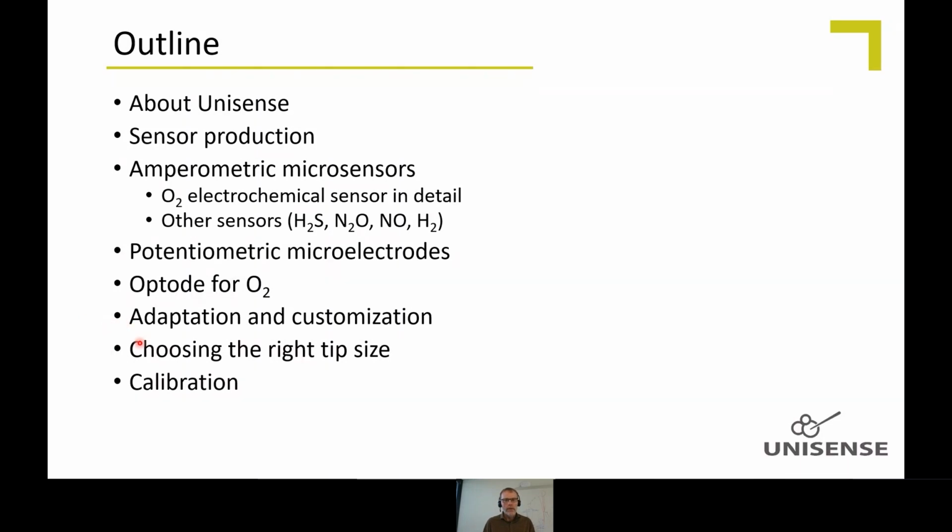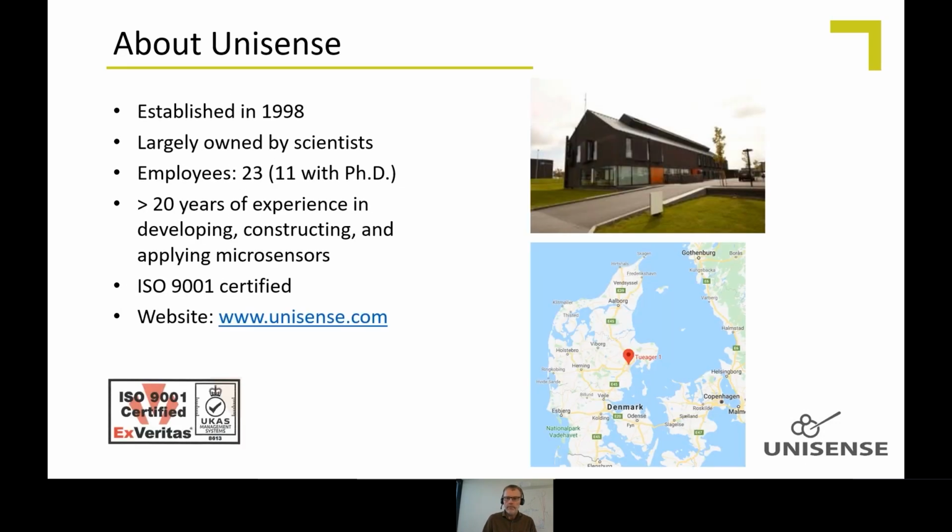Then something about the importance of tip size of the sensors. We make sensors in many different sizes, and there's a good reason for that. And then at the end also something about calibration, which is also necessary.